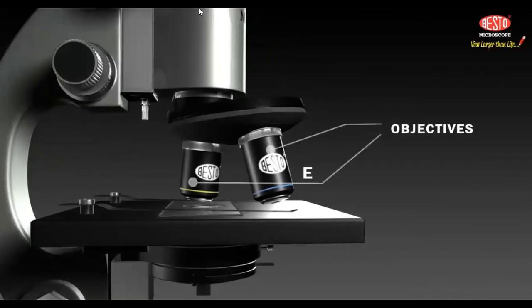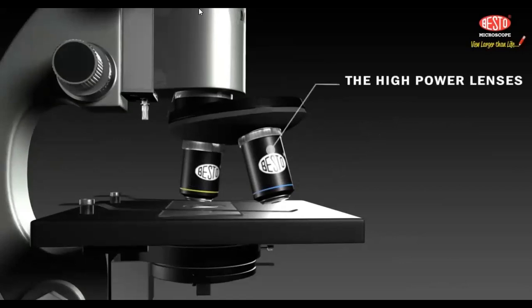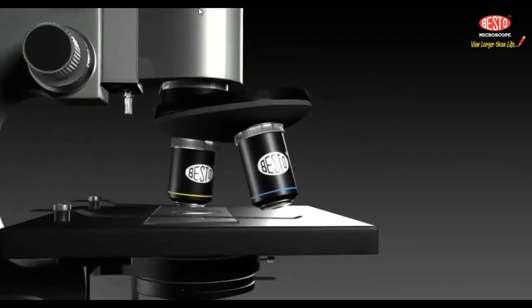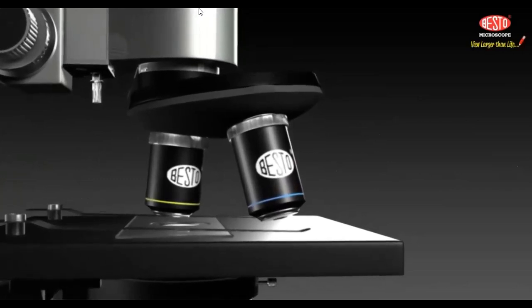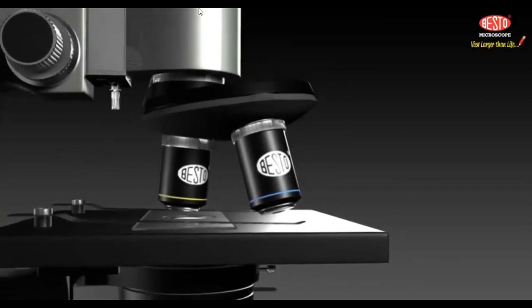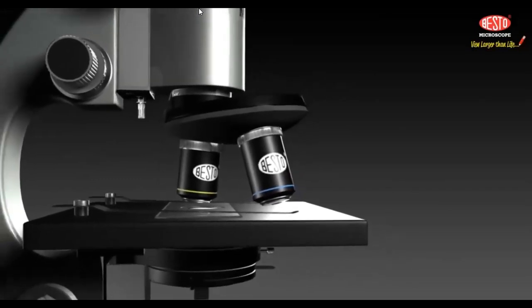The objectives are the parts at the bottom of the body tube closest to the sample you are examining. Each objective has a lens and a tube-like holder, the mount. The longer mounts hold the stronger lenses, the high-power lenses. The shorter mounts hold the weaker lenses, the low-power lenses. Like the eyepieces, objectives also come in various powers. A microscope has several objectives, for example, 4x or 5x, 40x or 45x, and 100x. Some microscopes only have 1 or 2 objectives.